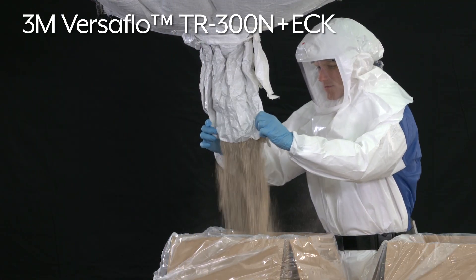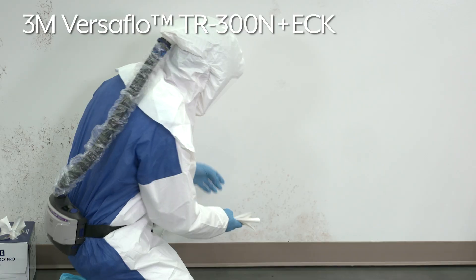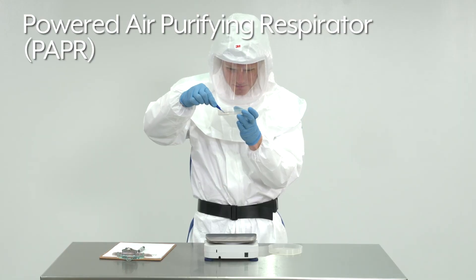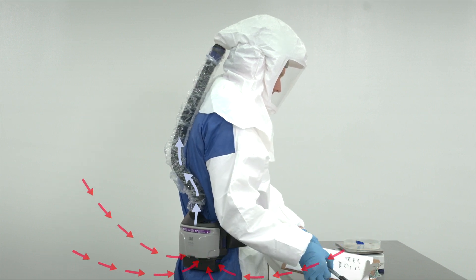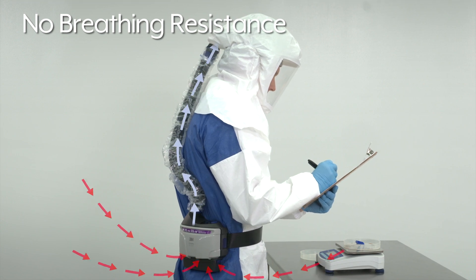Breathe easy while working around dust, powders, mold, and other particulates. The 3M Versaflow TR300N is a powered air purifying respirator that is lightweight and comfortable, providing up to 12 hours of continuous use. It is preferred over standard respirators as air is blown in through a filter, so there is no breathing resistance.